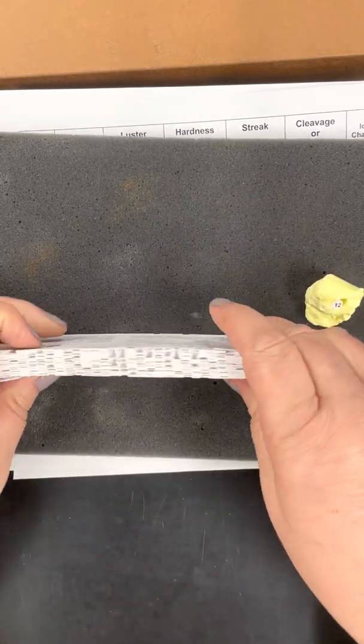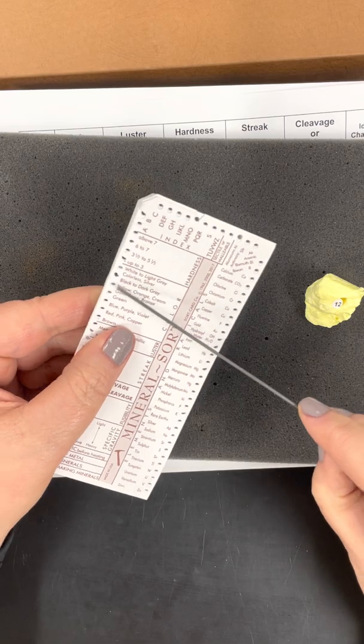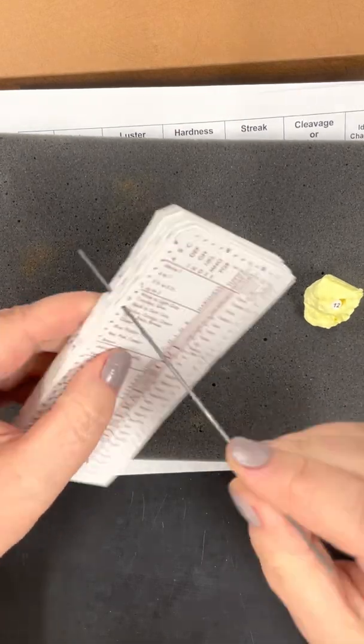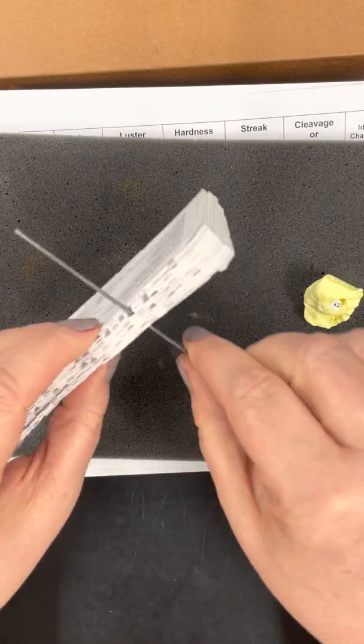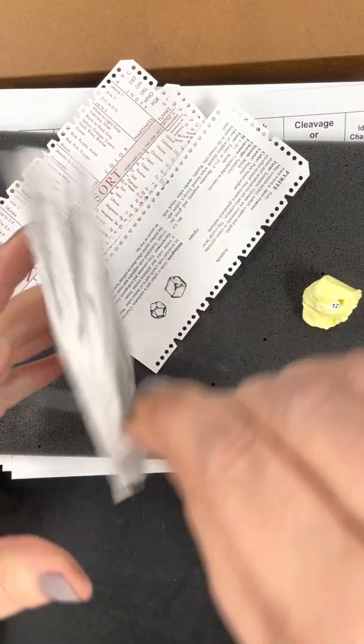So what I'm going to do is make sure that these cards are nice and close together. I'm going to take my long tool and insert it into this hole that says yellow. And this is the cool part. Hang on to this really carefully and then shake it out.